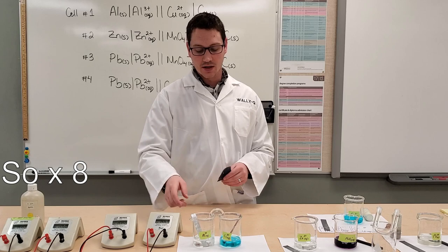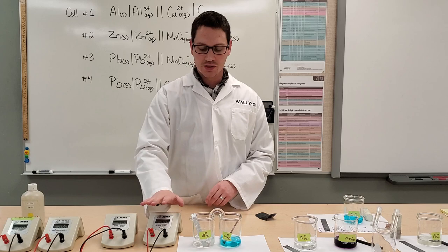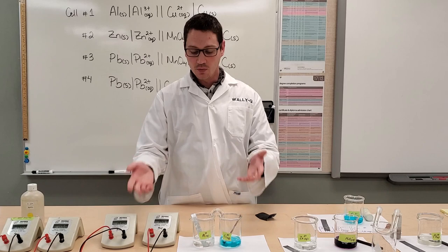And we'll show you that in a little bit. So all I have to do here, we've already pre-sanded all these electrodes. All we have to do is, now that we have our two half cells put together and connected by the U-tube or the salt bridge, we just need to take one of our voltmeters, connect them to the half cells, and then we'll be able to see the voltage.